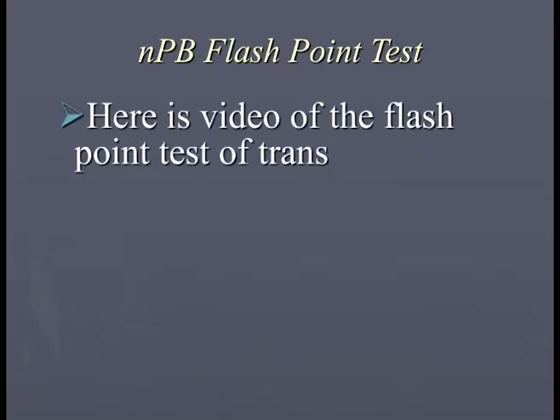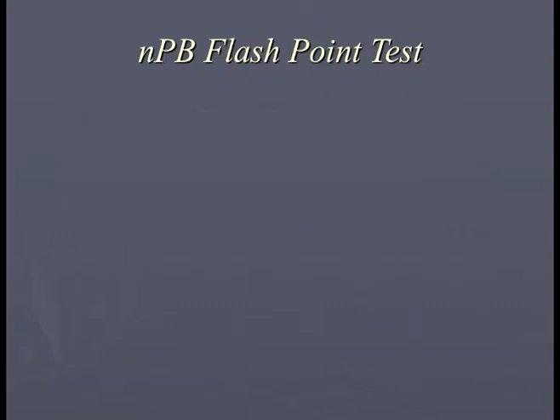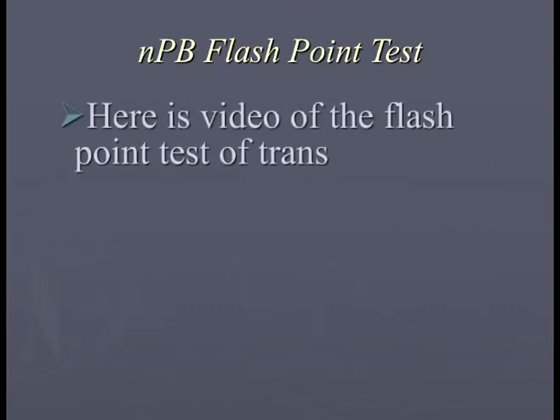So here's a video of the flashpoint test of trans. Before the test, the flashpoint unit was placed in a freezer to cool the system down. It typically gets to about minus 20 C, and let's see how it goes. Next flash, minus 14.